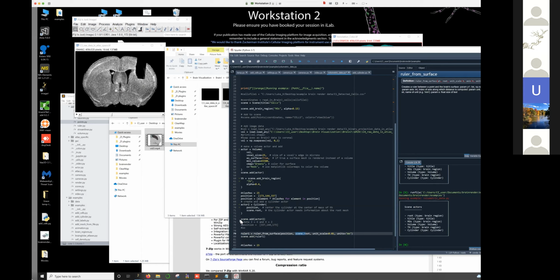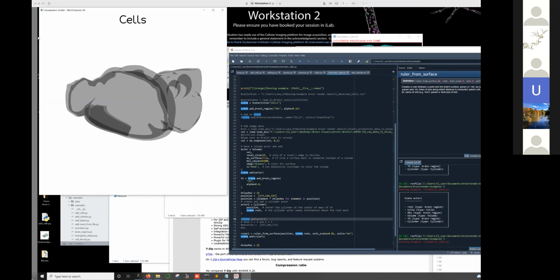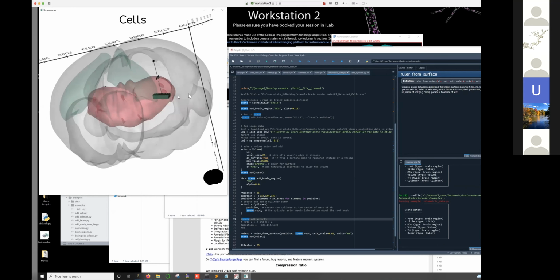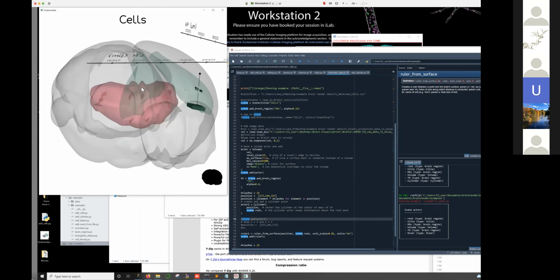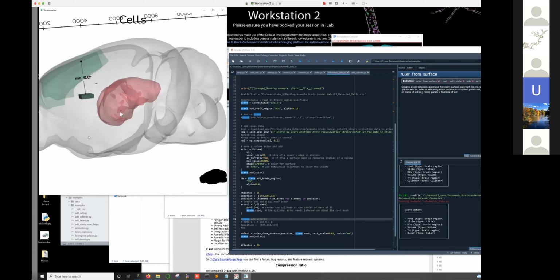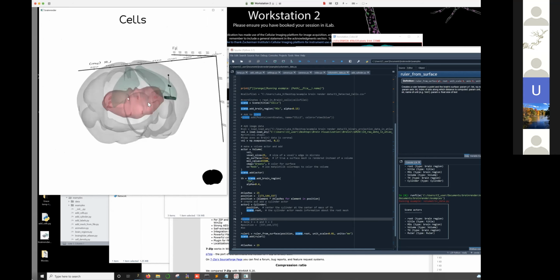And I'm just going to turn off the cylinder so we can see that clearly. And that's the last example for us. This is really the last thing that I wanted to show you guys in the brain render. So you can see now we have this nice measurement showing the depth of the grin lens. We could render the striatum in here, and we could render and measure distances to other brain regions if we were interested in that. So that concludes the different examples.